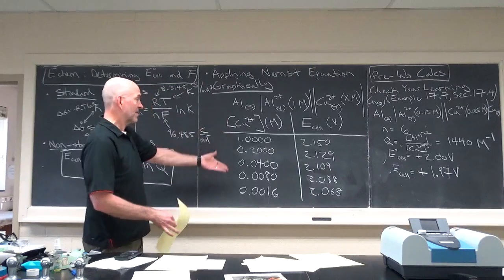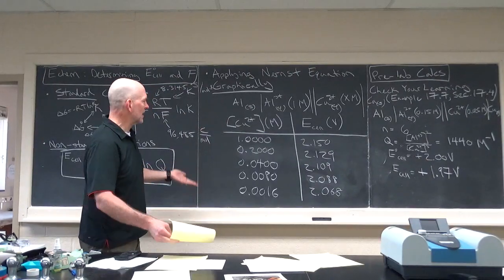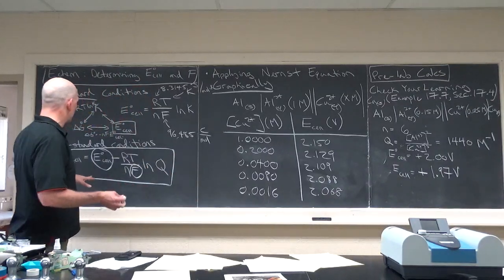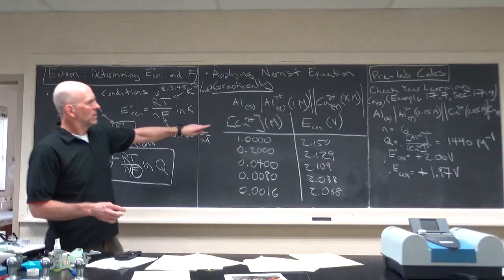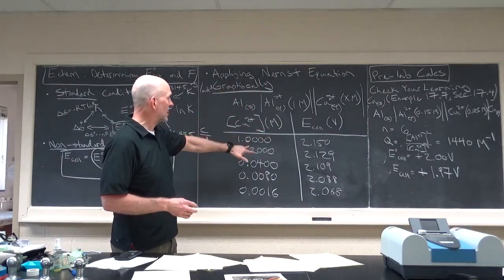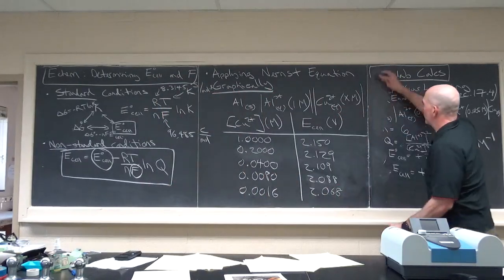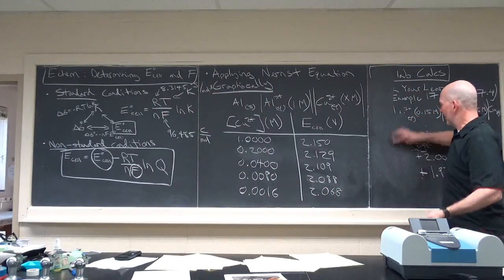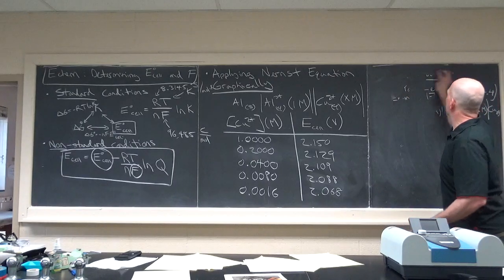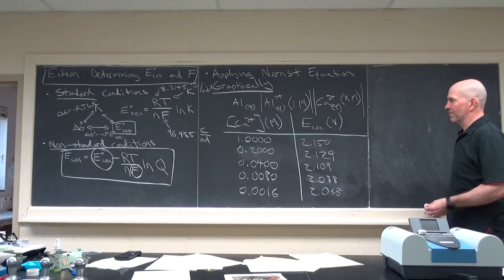Okay, so that's similar to the data you're going to collect. What are you going to do with that? Well, again, it's kind of genius. I'm probably going to need some space. So I'm going to take that space now. So we're going to make a graph. If you know what you're doing, you've read the lab, it's all in the lab itself. So the video is just kind of reiterating what's in the lab. But it may be helpful if you haven't done much of this lecture.